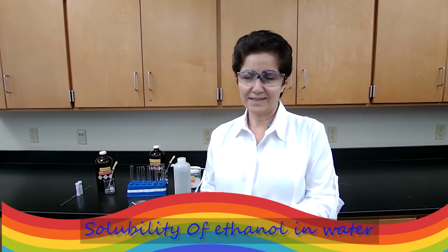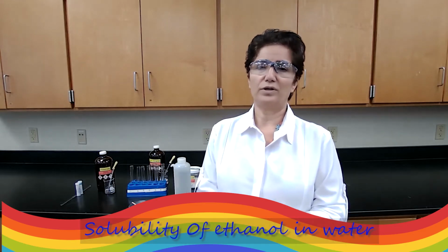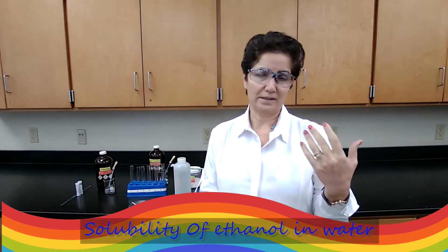Again, today we are going to do an experiment based on organic functional groups. One of the primary tests that we do for organic compounds is to test for solubility. Based on solubility, we may not come up with the exact functional group, but we could say if the compound is neutral, if it is a polar or non-polar compound, if the compound is an acid, like carboxylic acid, or if the compound is a base, like amine. So we test the solubility.